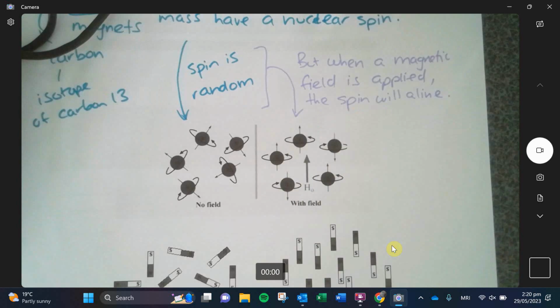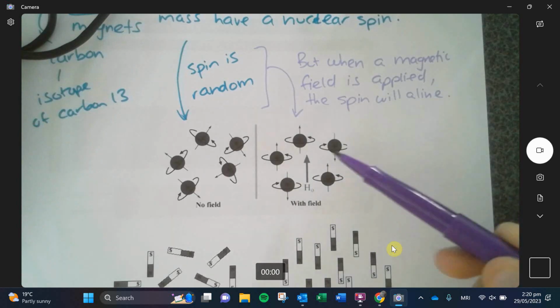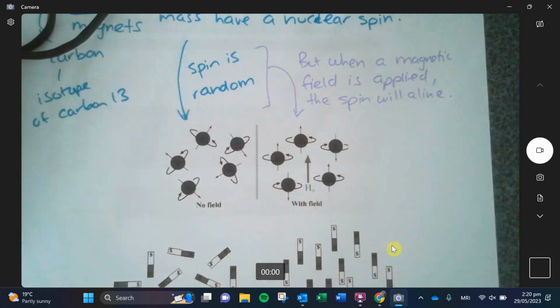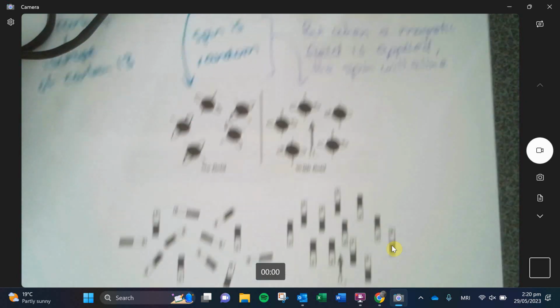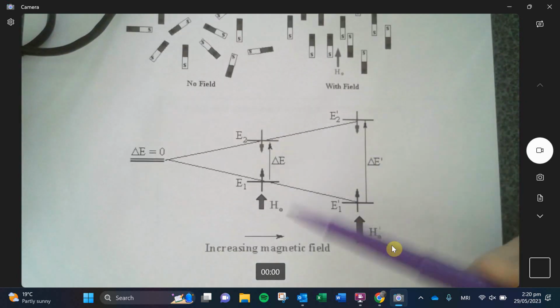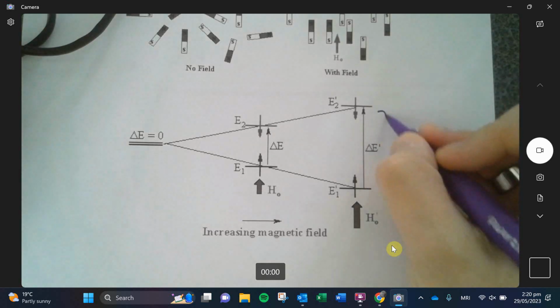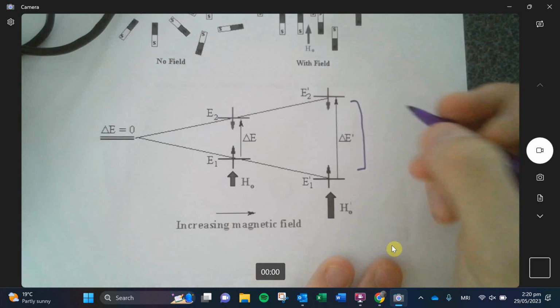Right now the spin is going upwards as a net, and I'm asking how much energy and strength from that magnet I need to put in to force it to flip the other direction. So this is showing how much energy is needed to cause the flip.